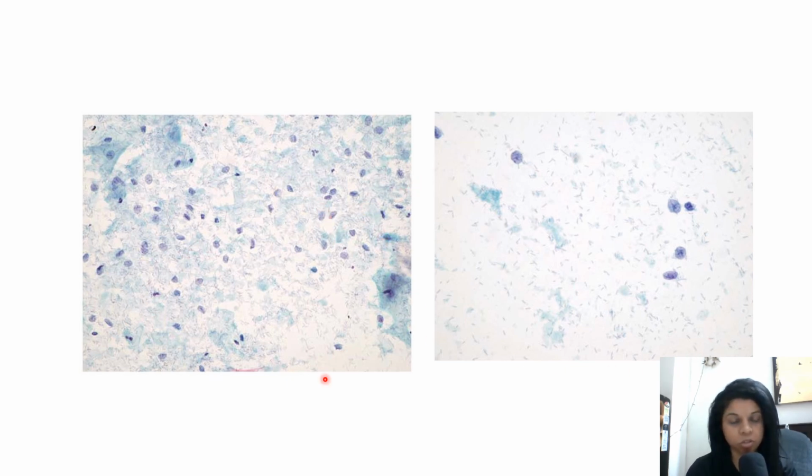It is secretory phase. I had said in my last presentation that in secretory phase, we are going to see a lot of lactobacillus proliferation along with intermediate cell proliferation, and there will be cytolysis. The cell has undergone degeneration, or dissolution. The cytolysis has happened, and then you can see cytoplasmic fragments and so much of bare nuclei. You can see a lot of bare nuclei in the background and cytoplasmic fragments without any nucleus.